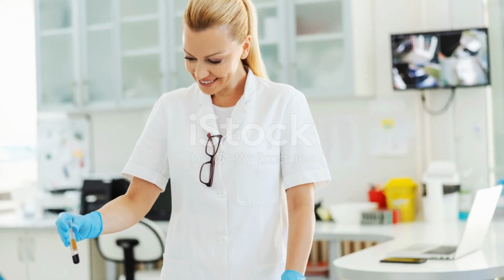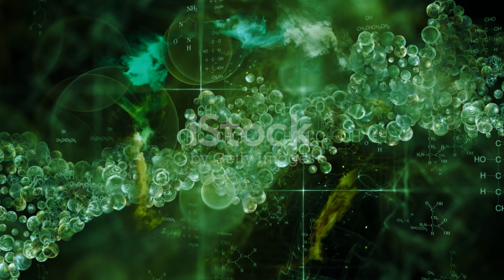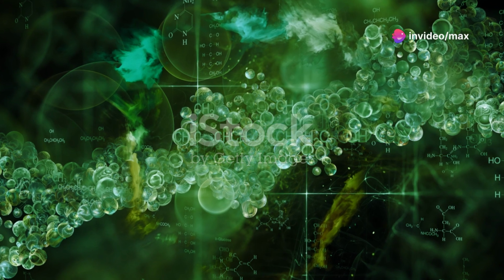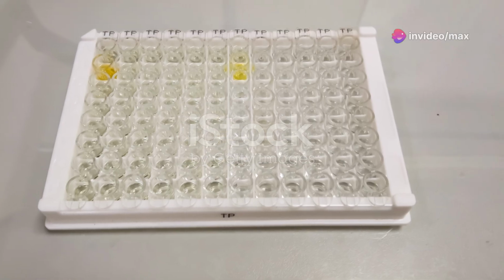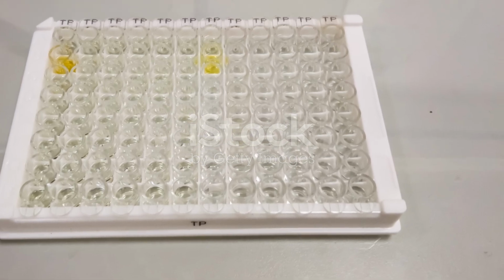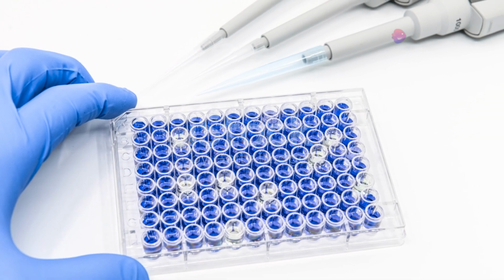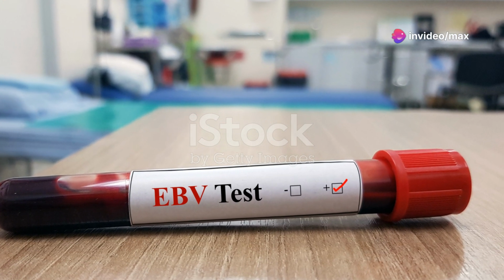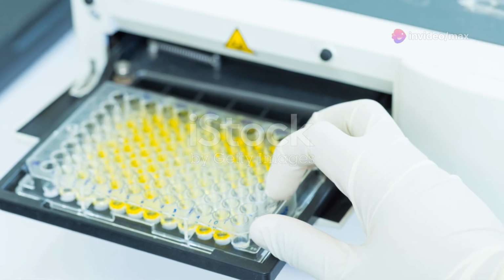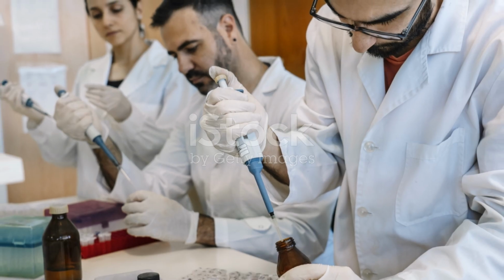Finally, the moment of truth. We add the substrate, our enzyme's canvas. If our target molecule is present, the enzyme will spring into action, transforming the substrate and producing a color change. We measure the intensity of the color change using a spectrophotometer. The intensity directly correlates to the amount of our target molecule in the sample. This elegant dance of molecules and washes culminates in a simple, easy-to-interpret signal revealing the presence and quantity of our target. But ELISA is not a one-size-fits-all technique.